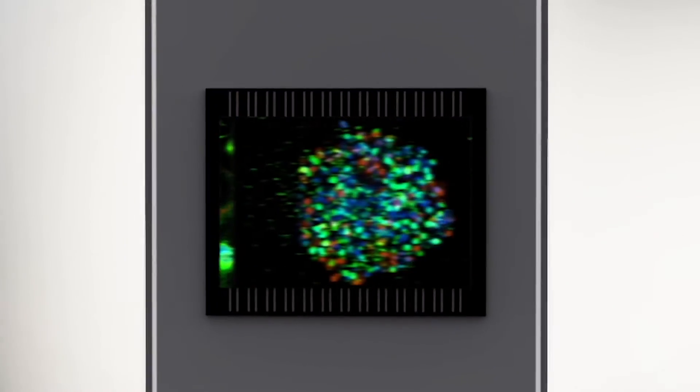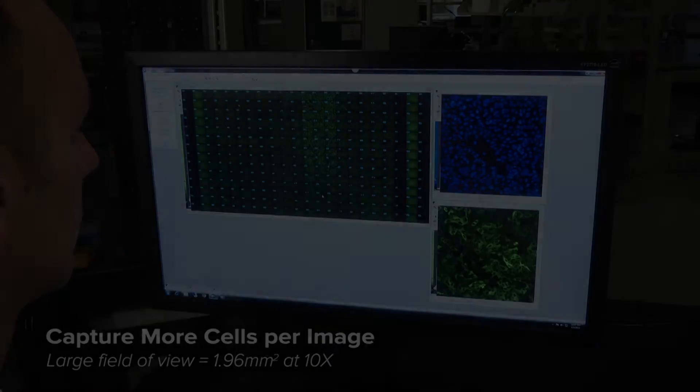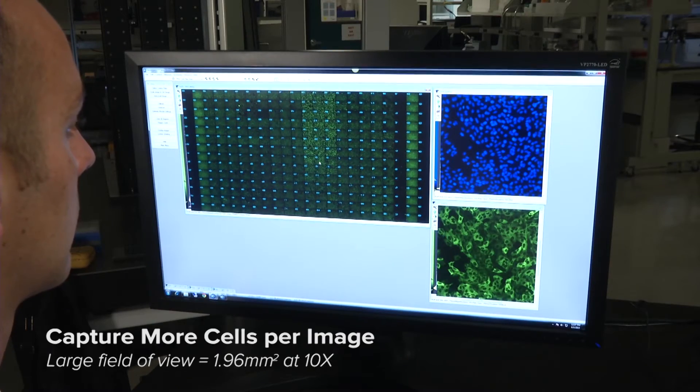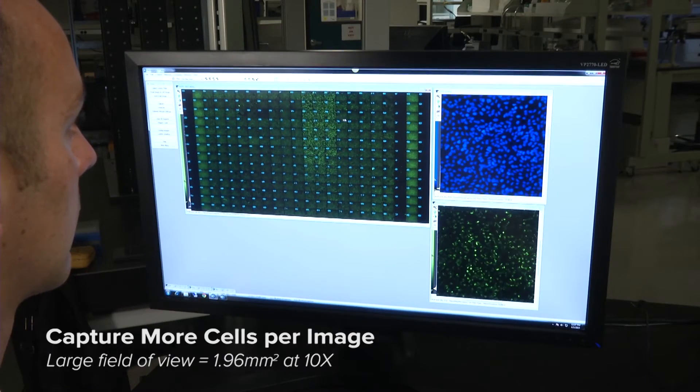This gives you the performance you need without any possibility for fluorophore crosstalk. You also gain one of the largest fields of view on the market to capture more cells per image.